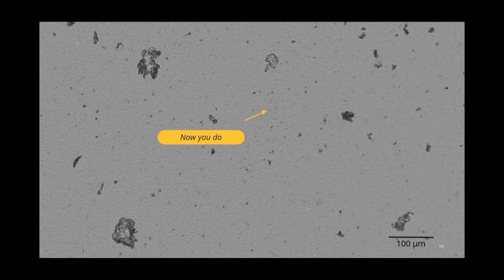And this is incredibly important for proteins, right? Because with the refractive index, the way they look in water is that they're virtually invisible. And therefore, light obscurators and flow imagers will tend to undersize and undercount these.